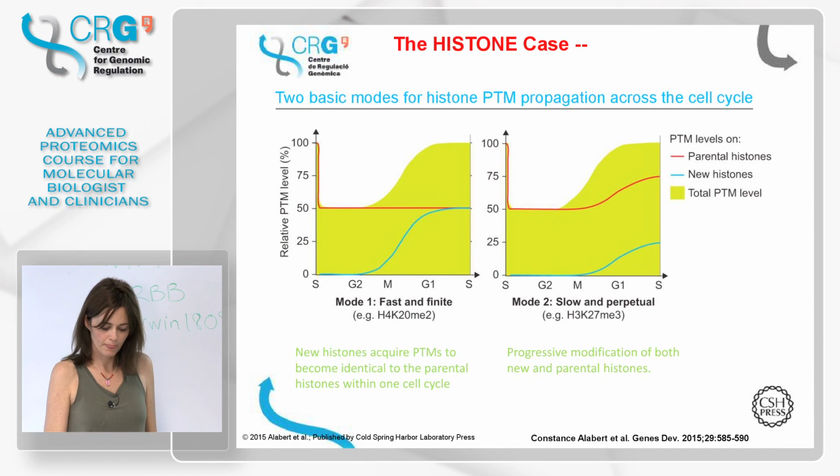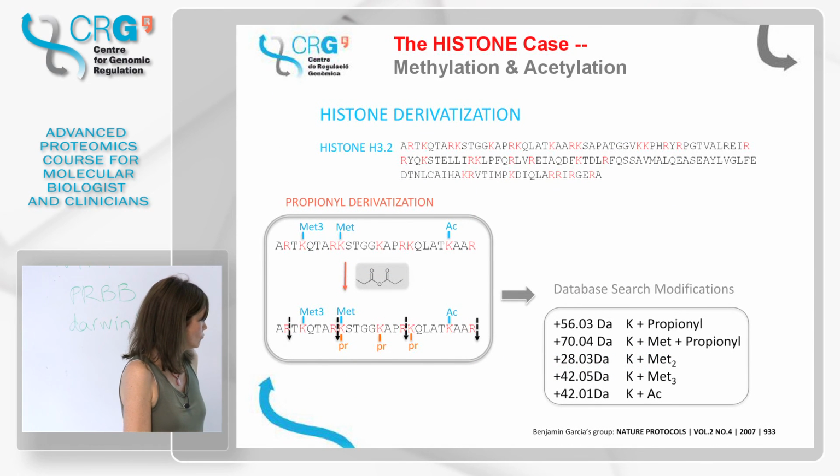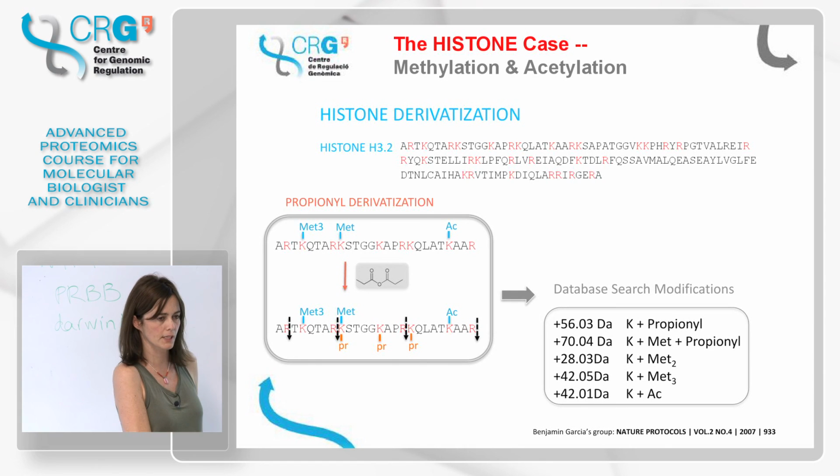But you will still have many peptides, no? With the peptides being very small. No, but this is now the right size. Instead of having this one of only 4, this of only 3, all these would be too small. Now we have them at double the size.